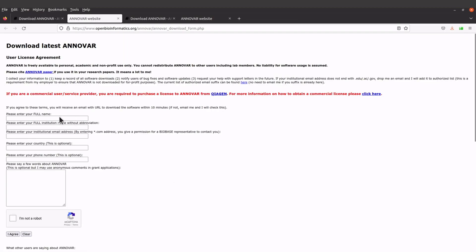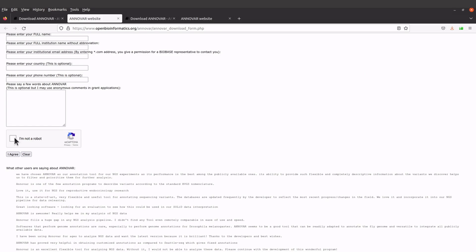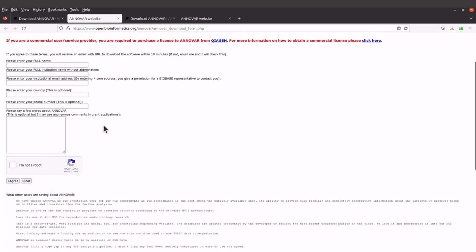The page will be displayed and when you are here you need to register — that's the requirement. You need to give some information: your name, organization, country, and phone number. The last two are optional, but your name, your institution, and your institutional email are mandatory. Once you have specified all this information, check 'I'm not a robot' and then click 'Agree'.